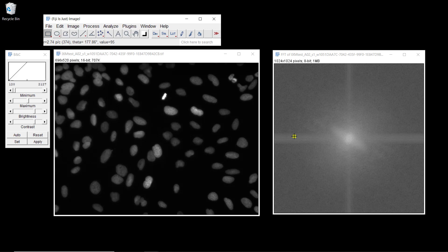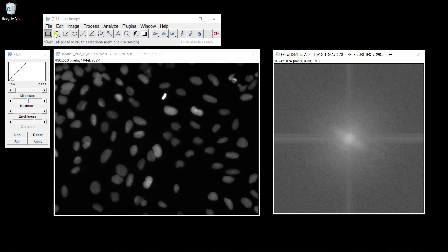In regions where your intensity is changing a lot, that corresponds to high frequencies. If you think about noise, it's going to be a region with very high frequencies because the intensity is changing a lot — that corresponds to the high frequencies of your spatial decomposition. So let's go back to the FFT of your image, and we're going to select the low frequencies. In this representation, low frequencies are in the center, and the further away you go toward the border of the image, the higher the frequencies you are considering. Let's select a region of interest in the center.